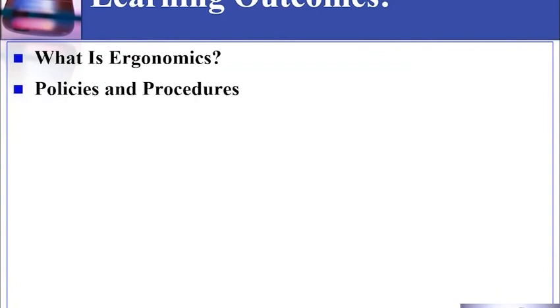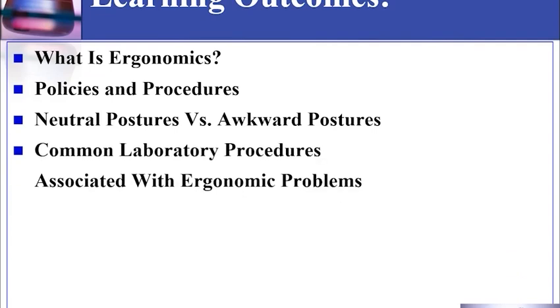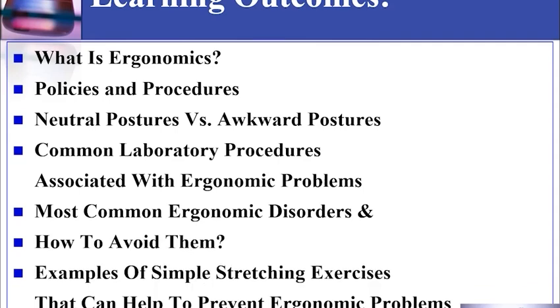The learning outcomes for this lecture: what is ergonomics? We'll talk about the policies and the procedures related to the topic, neutral postures versus awkward postures, common laboratory procedures associated with ergonomic problems, most common ergonomic disorders and how to avoid them, an example of simple stretching exercises that help to prevent ergonomic problems, and a summary.